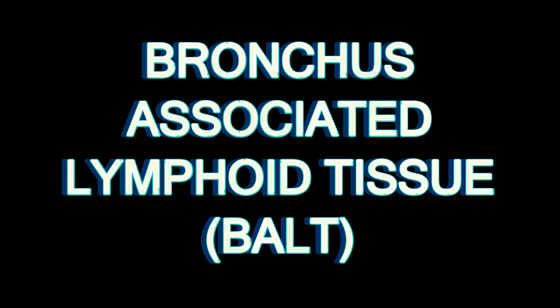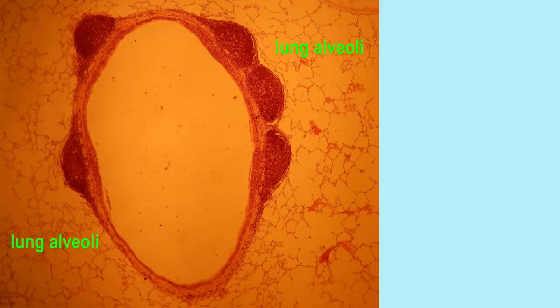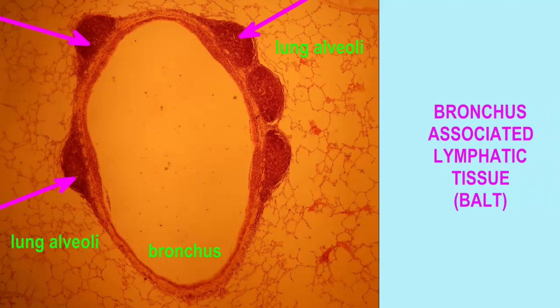In these images of lung tissue, you can observe the alveoli of the lung, a bronchus, and in the walls of the bronchus, bronchus-associated lymphatic tissue, or BALT.